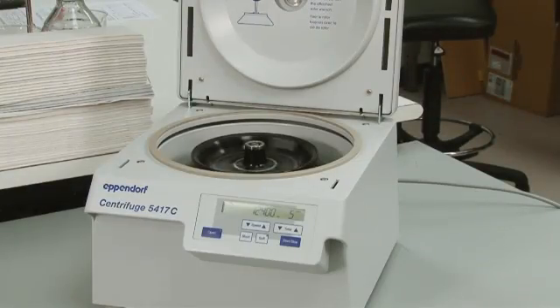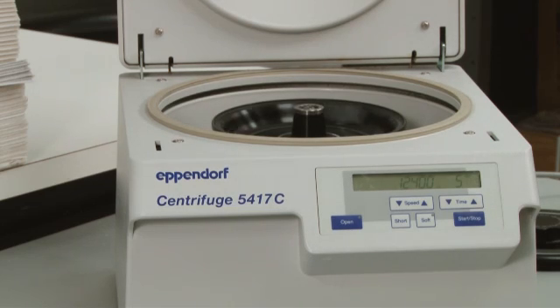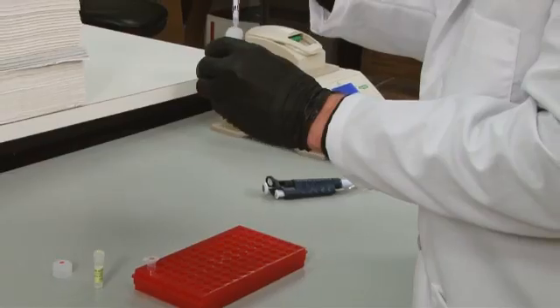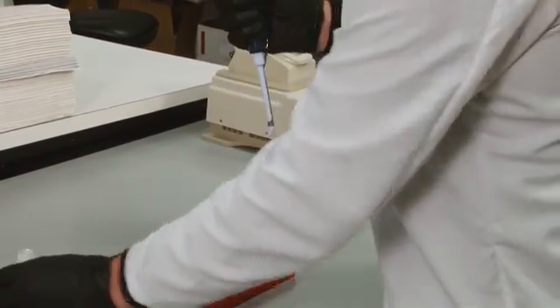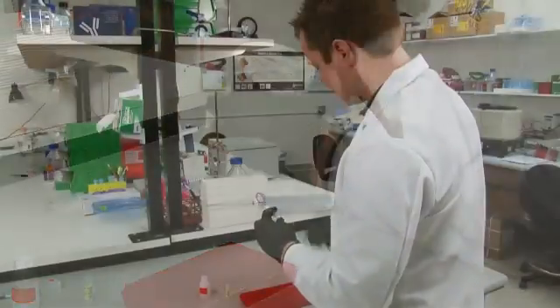After the samples have been successfully sheared, centrifuge at 4 degrees Celsius for 5 minutes at 12,500 G. Remove the supernatant and transfer to a new tube or aliquot into 10 to 40 microliter samples. These samples can be safely stored at negative 80 degrees Celsius for up to one month. To test for shearing efficiency while optimizing this phase and optionally afterwards, run one aliquot of your sample on a 1.5% agarose gel.